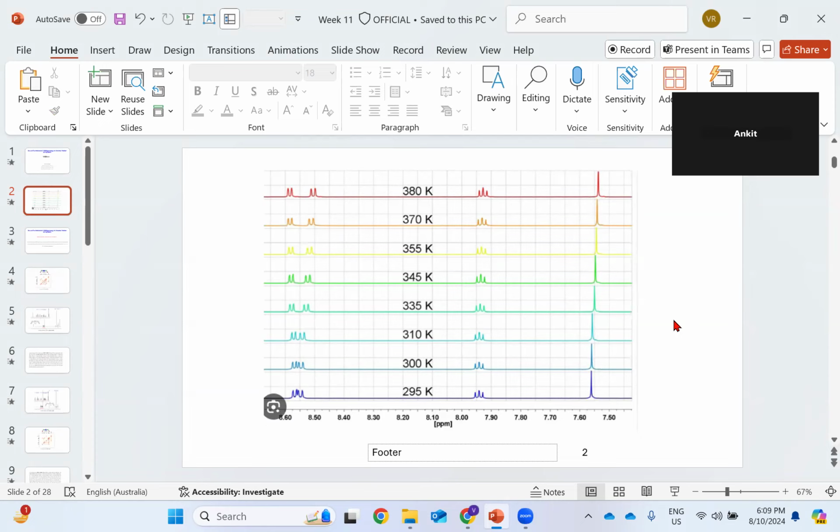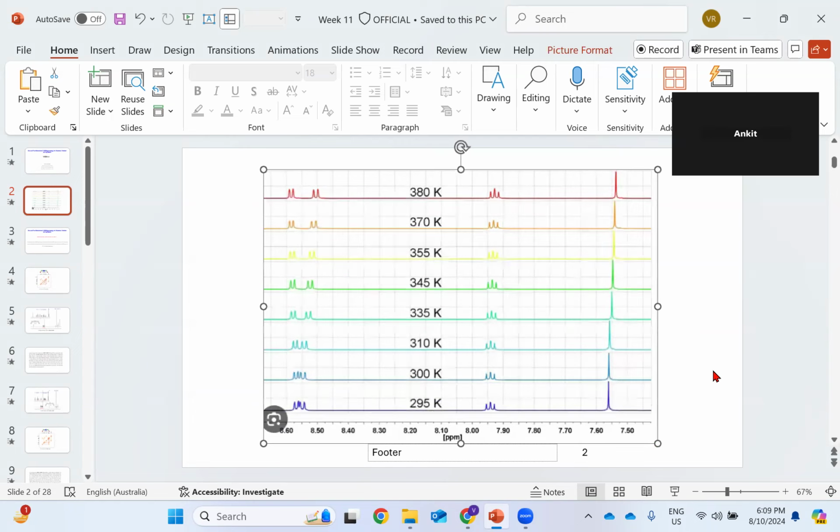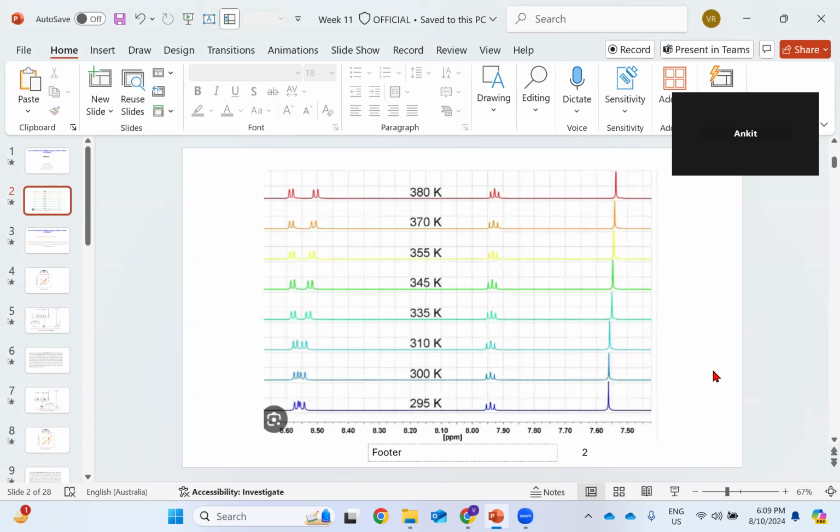That's why whenever we are recording the NMR spectra, the NMR instrument is kept in a room where there is a proper balance of the temperature. Generally, we keep the NMR instrument in an AC. We set multiple ACs at the same temperature, so the room will have a constant temperature and our spectra will not get affected.